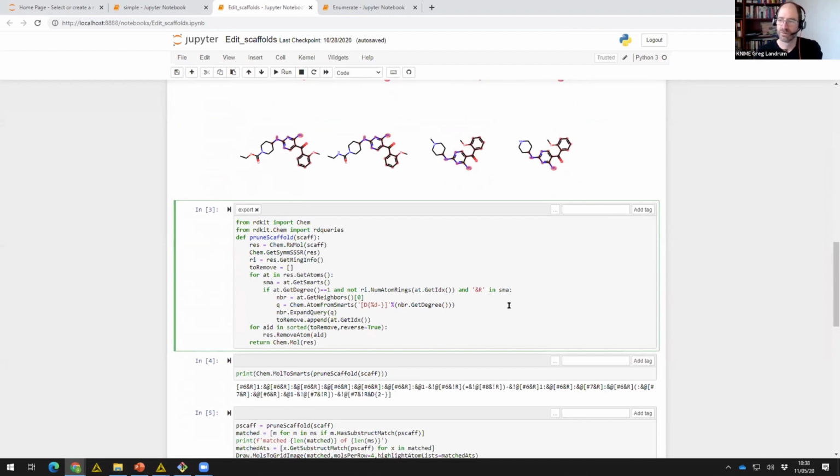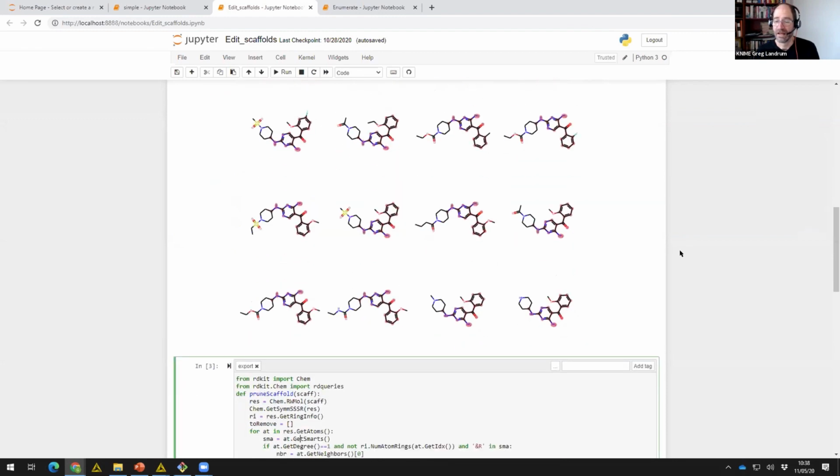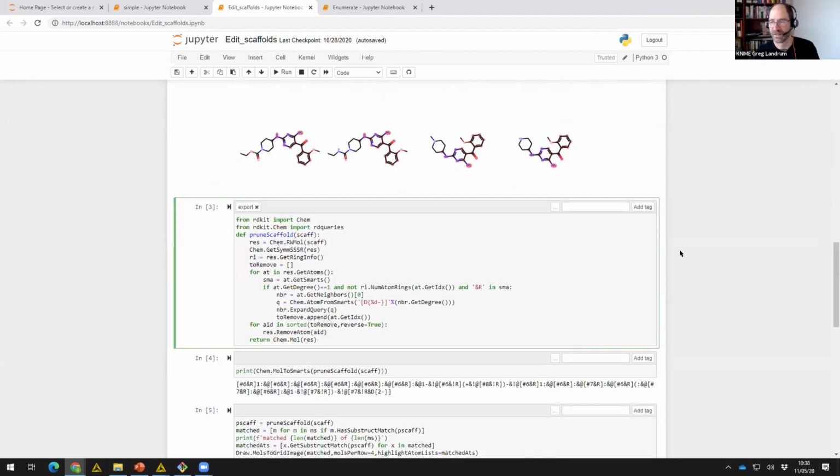What I'm going to do on the KNIME side is I have all of this testing code in the Jupyter notebook. And then I have a function. When I bring this into KNIME, I don't want to execute the testing code. I don't need all of that work done, right? Every time I run the Python scripting node, I really only want this function imported. So what I've done, and I'll show you how I did this when we go back to KNIME, is when I imported this notebook, I said only import the cells from the notebook that are tagged export.